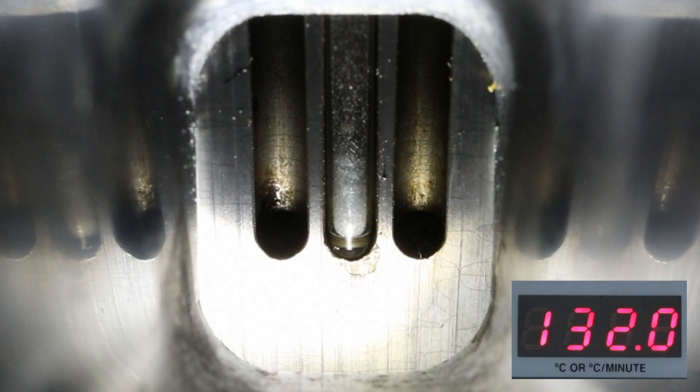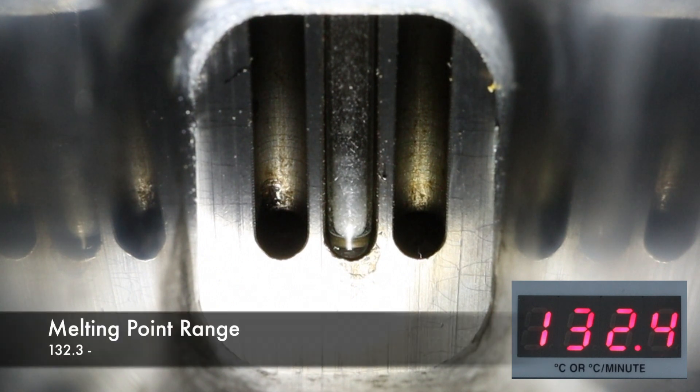I'm going to jump ahead a little bit to get to that point. Looking at the capillary tube, you can start to see some liquid droplets forming — 132.3 degrees Celsius would be the lower end of the melting point range.